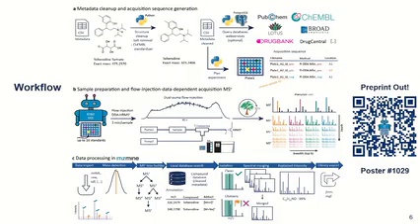We had this dual pump flow injection method. I will also not go into detail here. And in our case, we also acquired MSn data, so we didn't stop at MS2 because we wanted to have more substructure information. So this is also covered in this workflow. But as I said, especially this step is very optional, so this is just how we did it. If you use LCMS, GCMS, it's just another workflow, but in the end you can do especially the data processing in MZmine in the same way. Of course, the processing itself then depends on your acquisition.